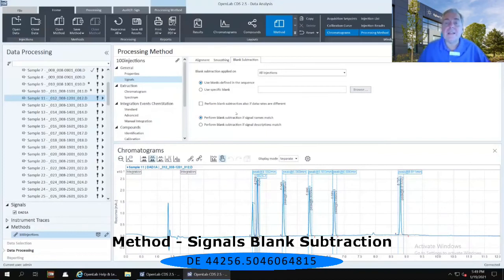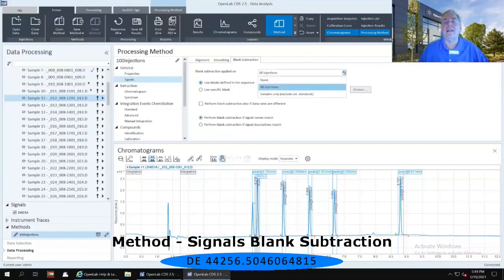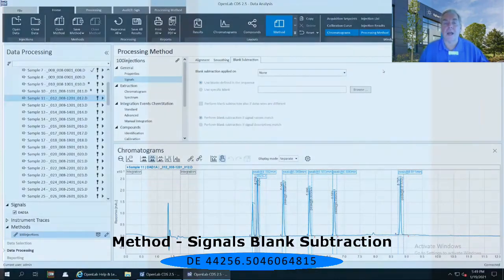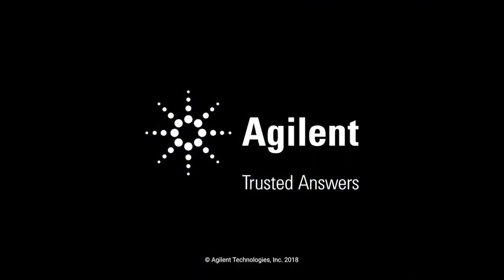In this particular case, we do not need to do any type of background subtraction or a blank subtraction. So I'm going to go back up to my all injections that I have highlighted, and I'm going to turn it back to none again, so it's not going to do any type of background subtraction.